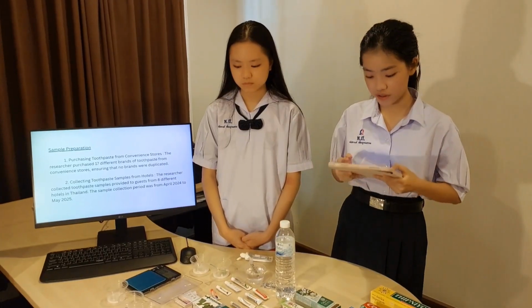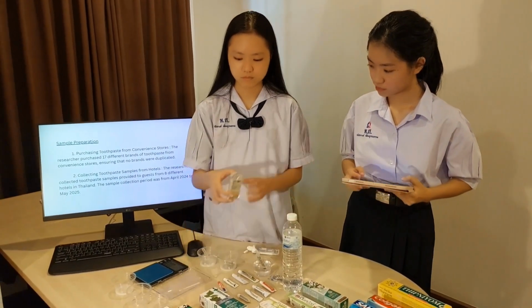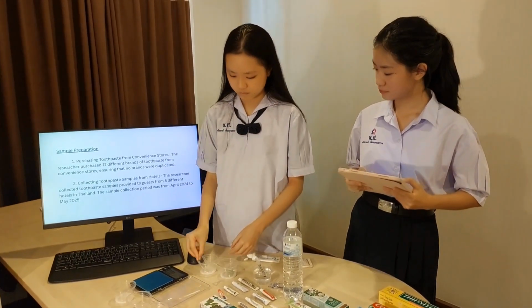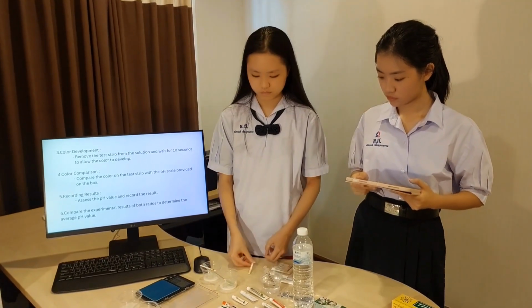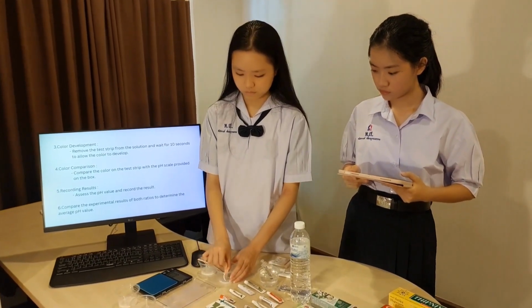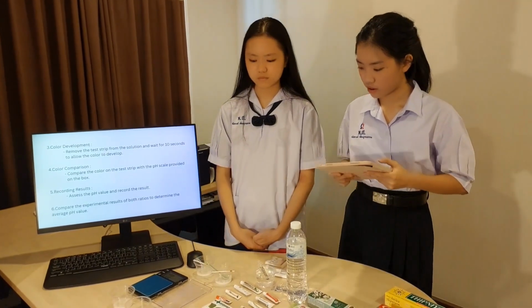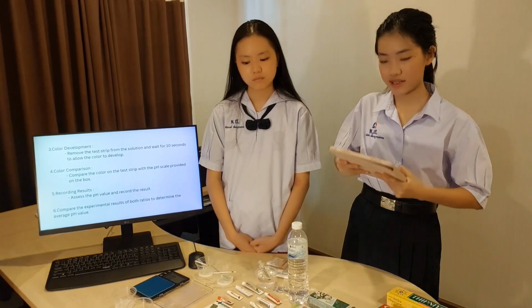Now, we have to dip the pH test strip into the toothpaste solutions for 2 to 3 seconds. And then we remove the test strip from the solutions and wait for 10 seconds to allow the color to develop.